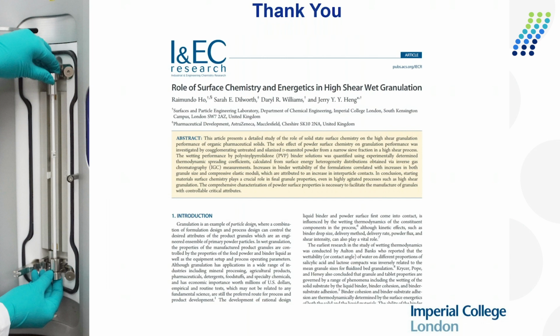I have another question. How was the polar component calculated for mannitol? Was it only using ethanol? Yes, as I recall correctly, we made a decision to use a slightly different method than normal. We actually used the retention behavior of ethanol and some calculation. We determined the specific retention volume for ethanol for the different materials, and we developed a technique around that to determine the polar contribution. Probably not quite a standard method, but it did work quite well for us.